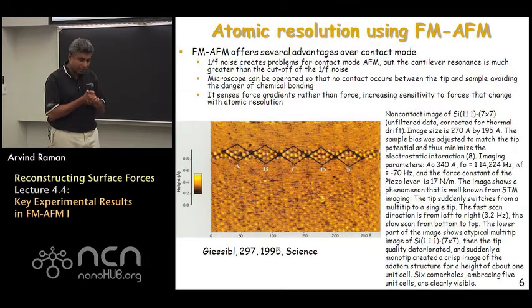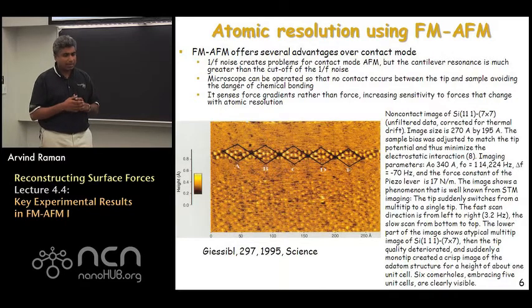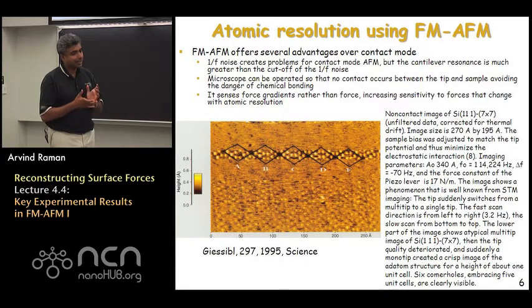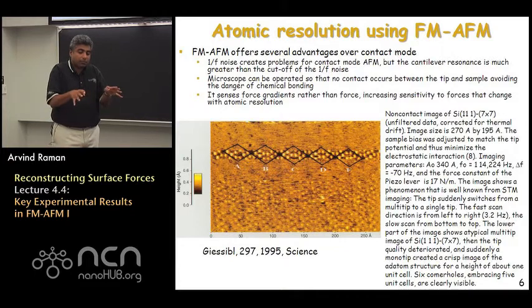The other important thing was that the force sensitivity of FM-AFM is so high that one could operate with a stiff cantilever in the attractive regime or slightly repulsive regime without applying very large forces. So one could ensure that the tip doesn't crash into the sample, that it's a very gentle probing of the surface that allows us to get atomic resolution. The last important thing is that the principle of FM-AFM, in fact of all dynamic AFM methods, is that they tend to sense gradients, or weighted versions of the gradients, of the tip-sample interaction forces, which increases the sensitivity to those forces that change spatially over the sample.